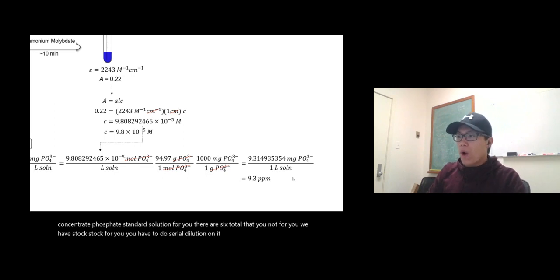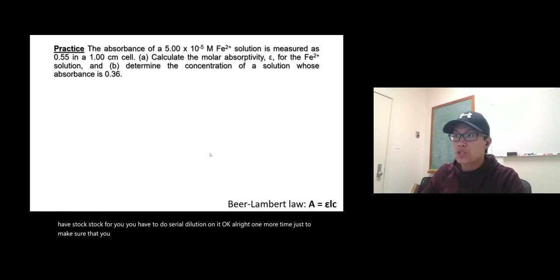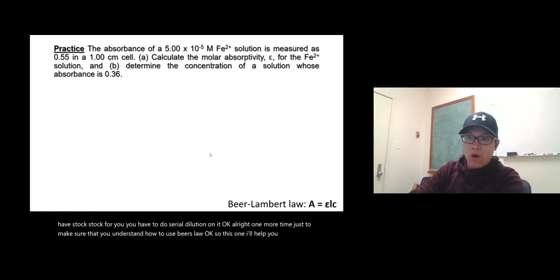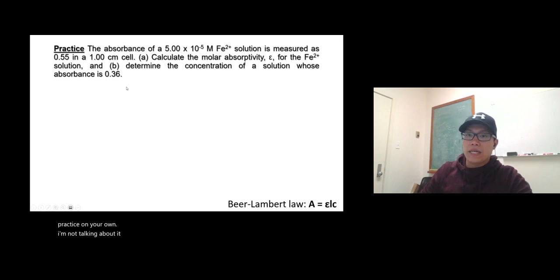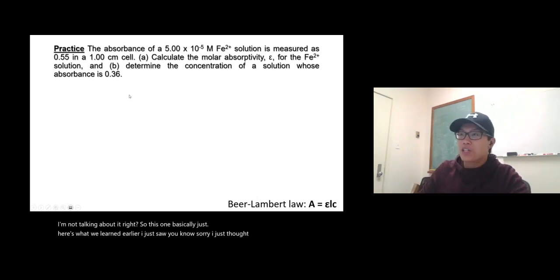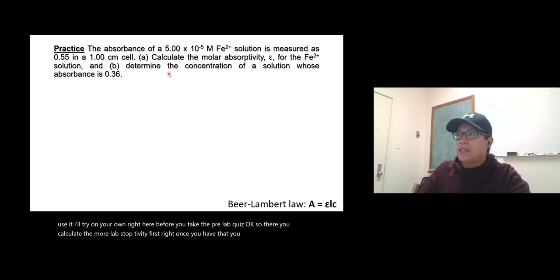Okay. All right. One more time, just to make sure that you understand how to use Beer's law. Okay, so this one I'll have you practice on your own. All right, so this one basically just use what we learned earlier. I just taught you earlier how to use it. Try it on your own right here before you take the pre-lab quiz. Okay, so there you calculate the molar absorptivity first. All right, once you have that, you can determine the concentration of any solution.